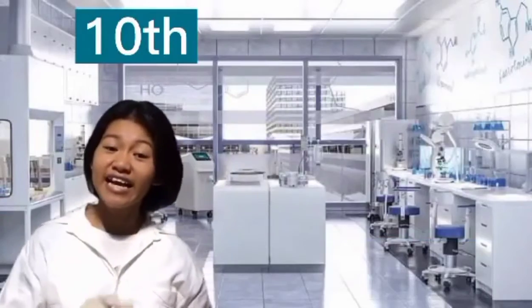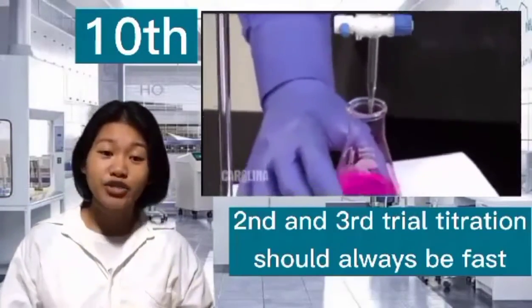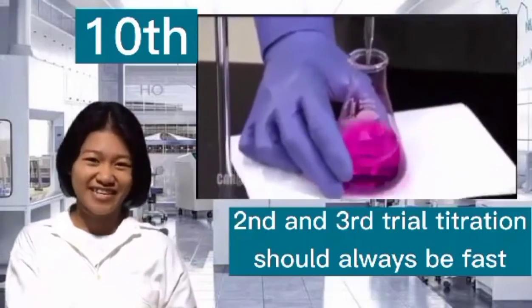Tenth, the second and the third trial titrations should always be fast, assuming that the sample will be about the same because you know approximately how much titrant is needed. If the first titration required 25 mL, then you can add 22 mL all at once and then proceed cautiously.